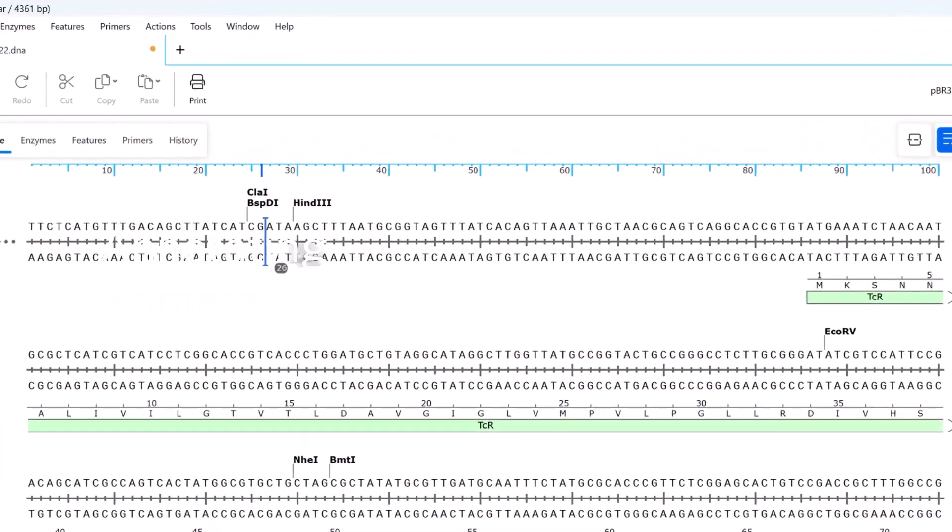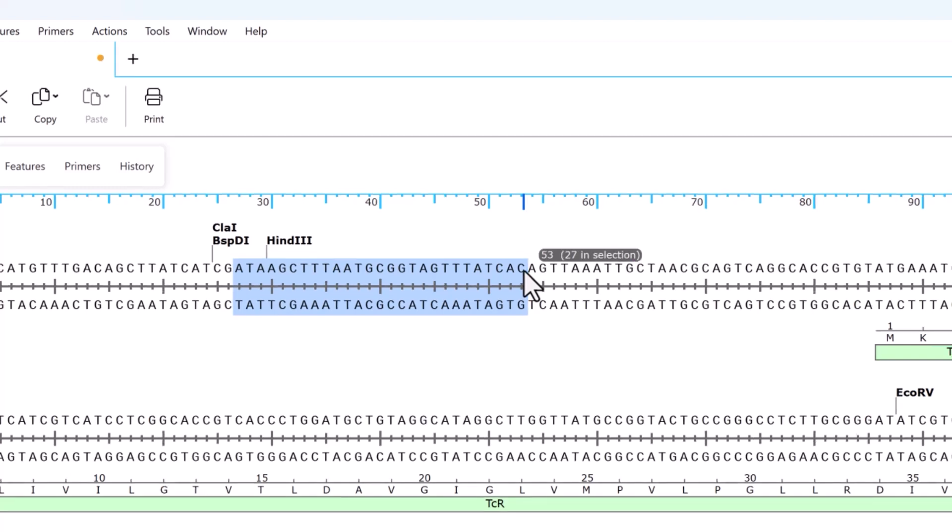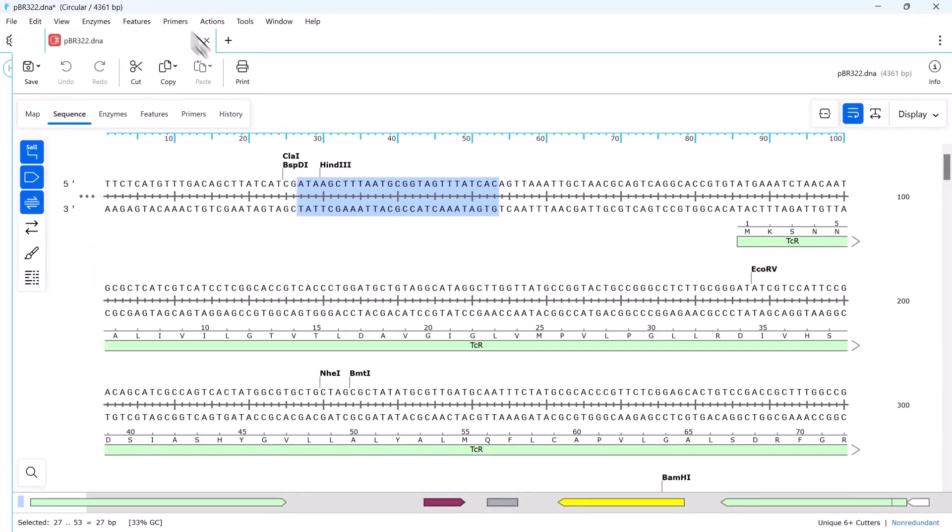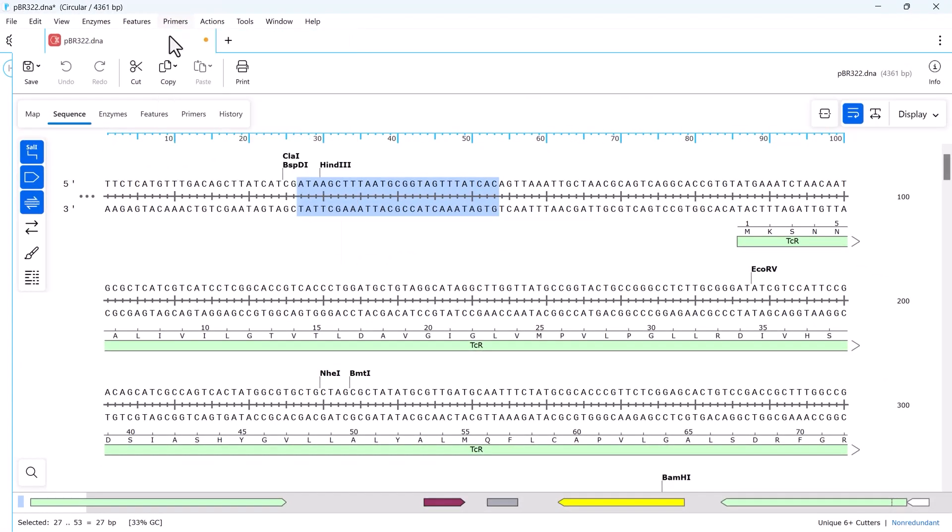You can create new primers via the sequence view. Click and drag to select a target primer binding site. SnapGene will automatically calculate the length and melting temperature of the matching primer. It's easy to convert your selection to a new primer via the Primer menu window.